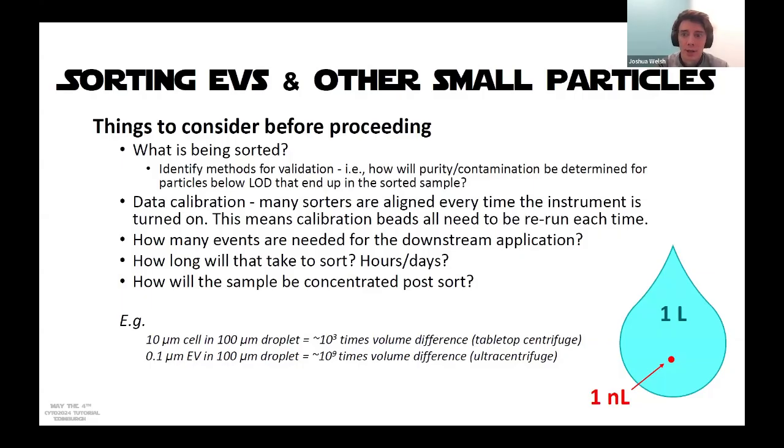So it's extremely resource intensive, and if you're working from a core, it's probably not possible to hire your instrument for 48 hours unless you're allowed to be extremely disruptive to other users. So I don't know if Vera or Joanne has anything they'd like to add to that.